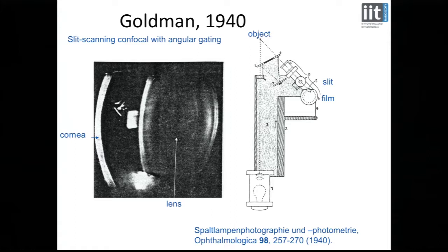But it's actually what we sometimes now call semi-confocal, because instead of using a pinhole, it uses a slit. And so what we do is we illuminate the sample with actually a line of light, or actually a sheet of light. So this is really also what's now called the SPIM, the selective plane illumination microscope, or a light sheet microscope. They all become the same in the end. So you illuminate with this sheet of light, or effectively a line of light, where it cuts the focal plane. And then this line is imaged onto a slit here. And the slit acts like the confocal pinhole and does the optical sectioning in the same way as the pinhole. Not quite so efficiently, and I'll show some example of that later on, but it's not as good.